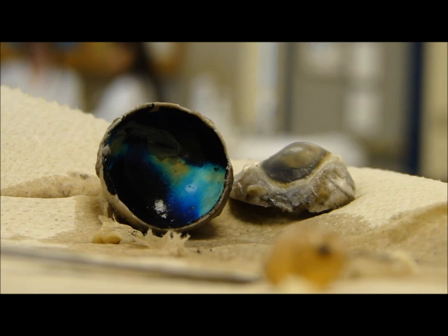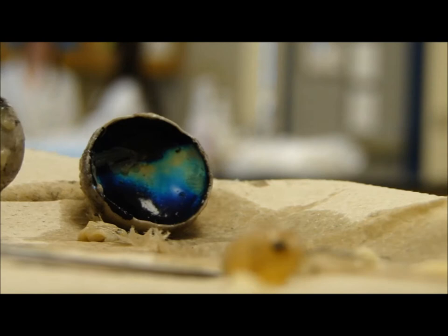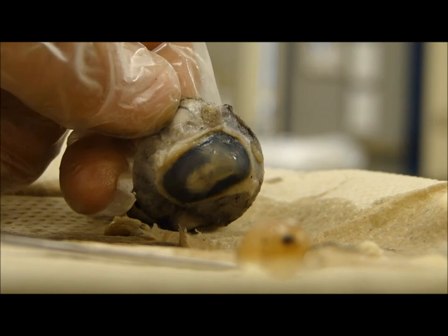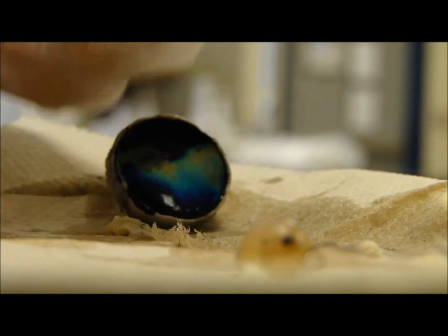Now it says turn the front half of the eyeball over so that you're looking at the cornea. So you're looking at the cornea — the top, that thing. Cut the front of the eye around the outside of the cornea where the cornea meets the sclera to remove the cornea. This cut works best if you make the initial incision with the scalpel and then use scissors to finish. We're cutting it out.